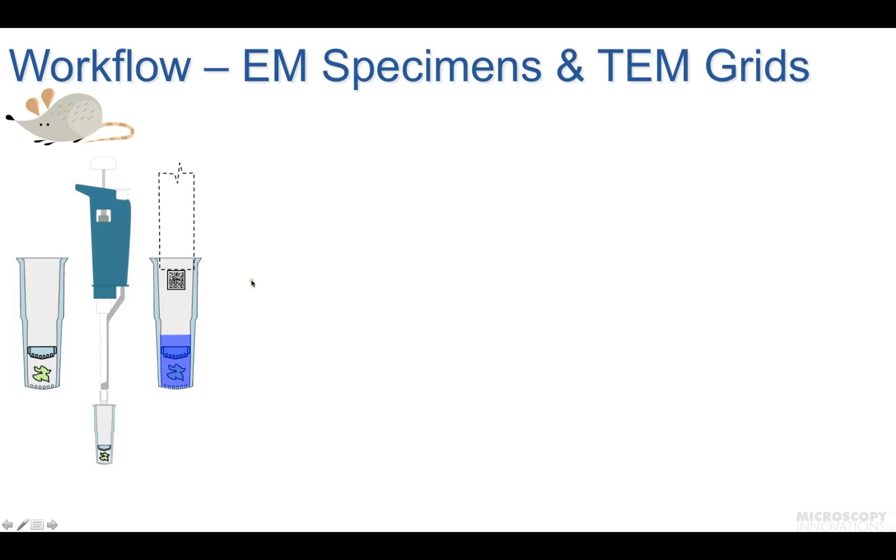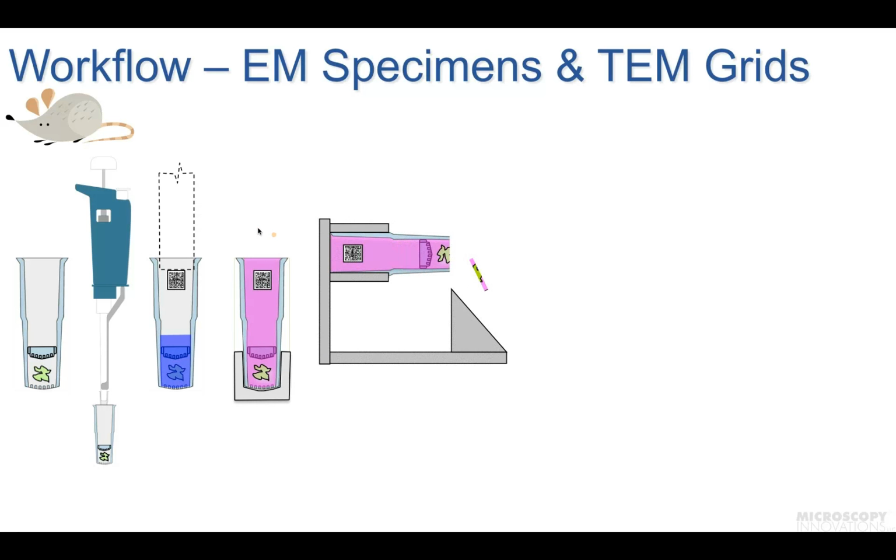agitation. Once the specimen is in resin, the capsule is ejected and placed into a tightly sealing container so it seals the bottom of the capsules, and then this assembly is transferred to the oven for curing the resin. Once the resin is cured, the specimen within the capsule is directly clamped into the microtome chuck, and the block is faced through the capsule, and the sections are obtained. So this is where the mPrep S capsules are used. Of course, we can also do SEM sample preparation, and we would be taking this through fluid processing and not through embedding.